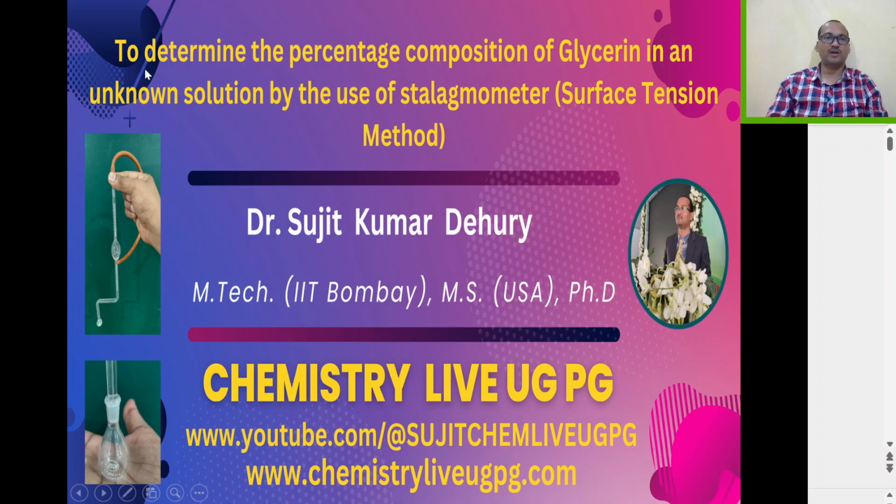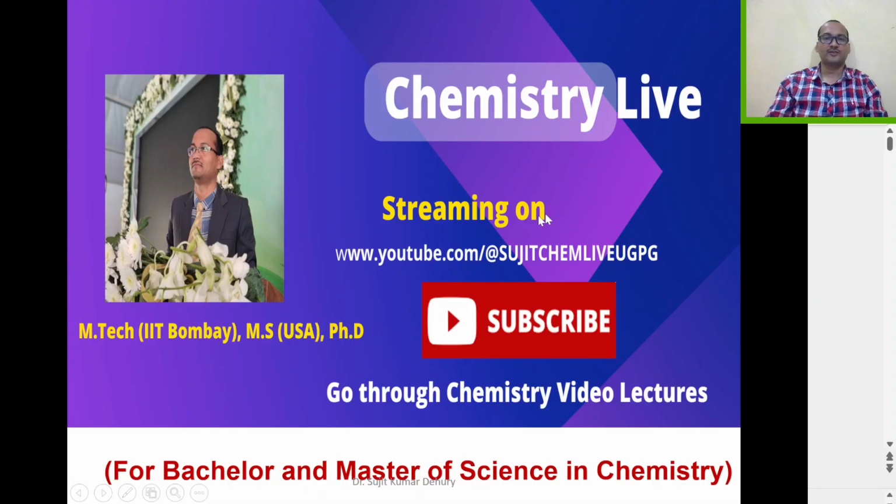So let's talk about how to determine the percentage composition of glycerin in an unknown solution by the use of a Stalagmometer, that is, the surface tension method. This will be highly beneficial for BSc and MSc chemistry students.